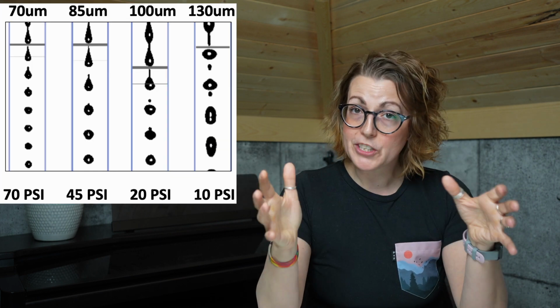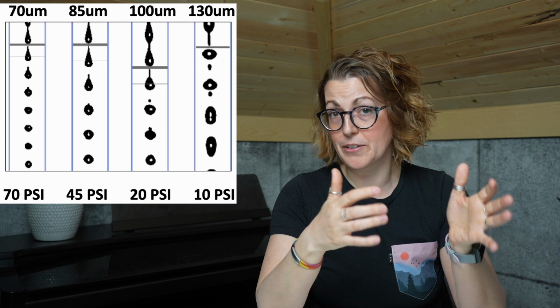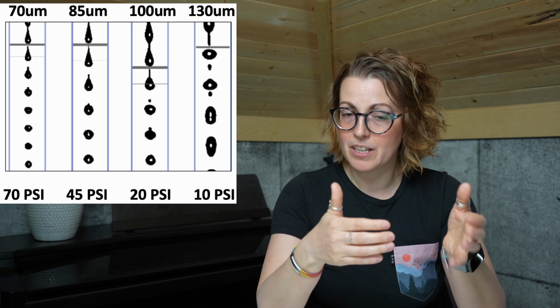In practice, choosing the optimal nozzle size may require some troubleshooting, some trial and error, and some optimization based on your specific sample. As you can see in the image here, pressure will play a role in this. The smaller nozzles operate at a much higher pressure than the larger nozzles. This is also why you can generally sort a little bit faster on them. So there's an interplay here between the effects of pressure on your cells versus the effects of a longer sort on your cells, and those two go hand in hand and are an important consideration when determining your nozzle size.